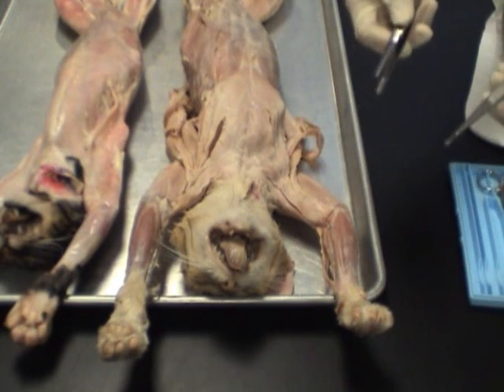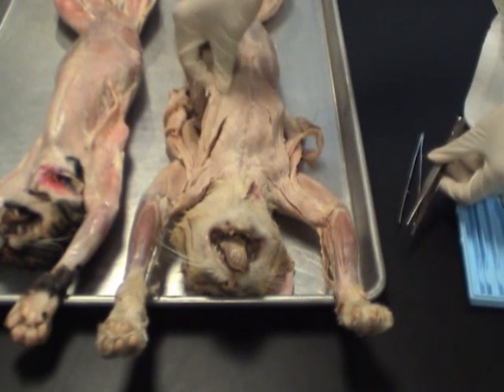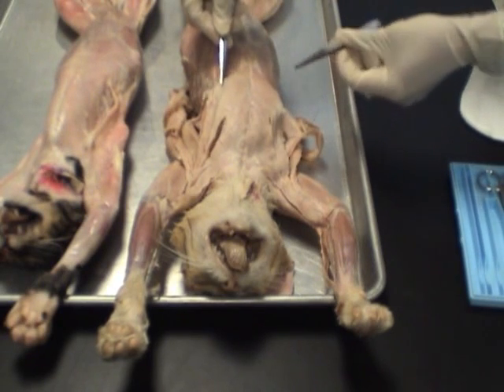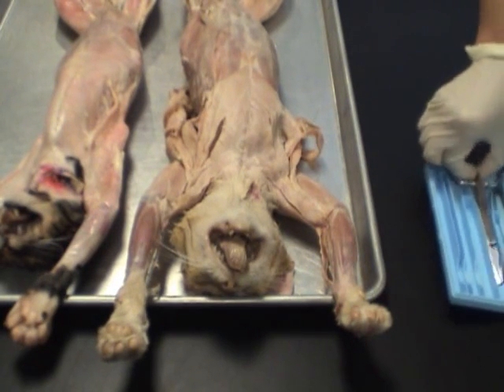And remember, always try to hold the tissue with tweezers. Don't try to hold it with your finger like this. Okay, this is a major no-no. So use tweezers or use pickup to hold whatever it is you need to hold back. Okay. Next up is scissors.